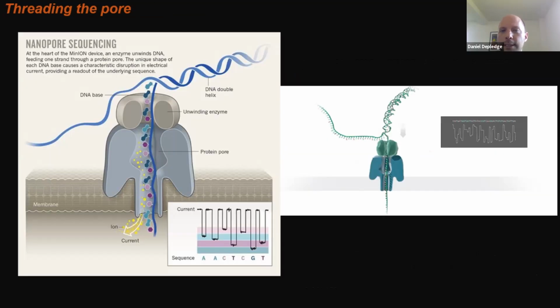But principally how it works is you can take a piece of DNA or RNA, in this case, hopefully not fragmented. In the case of, say, RNA, you could ligate a specific adapter to the poly A tail, or if it's DNA, you could do some very gentle shearing to produce fragments that are tens, if not hundreds of kilobases long, and add adapters onto the ends of those.